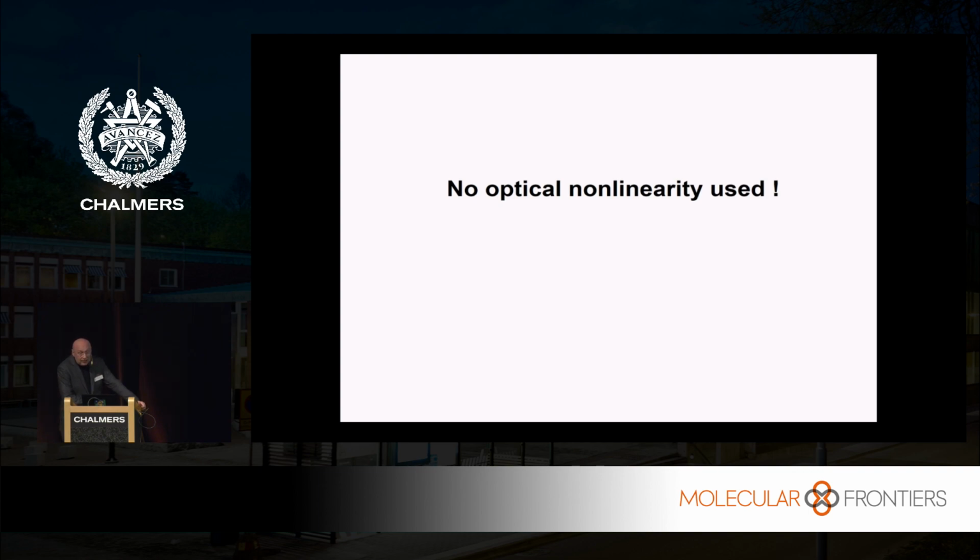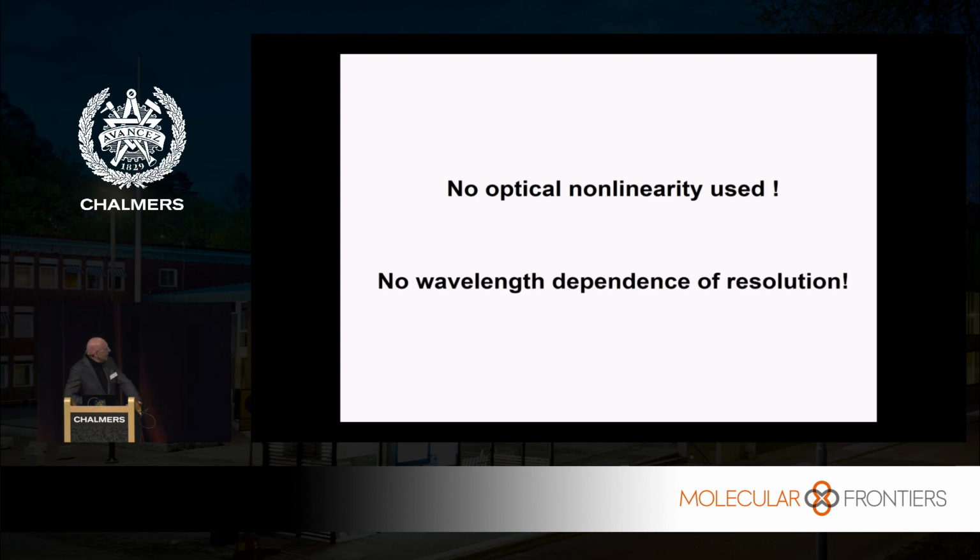Now, for the physicists, a few insights. There is no optical nonlinearity used in here. When I was a student in the 80s, I knew, of course, that using some nonlinear optics, you can overcome the diffraction barrier. But this was kind of leading in the wrong direction. There is no optical nonlinearity used in here. And the second thing, there's no dependence on the wavelength in the resolution. If you think about the way it works, there's no dependence anymore.